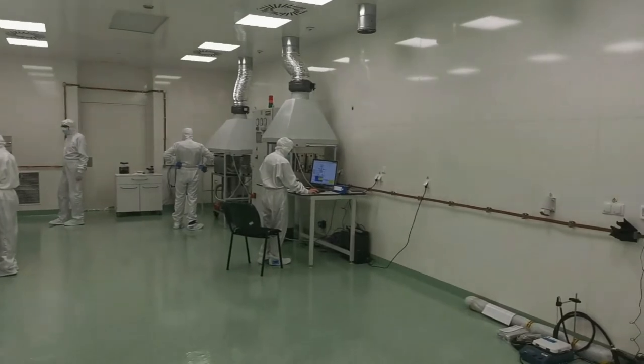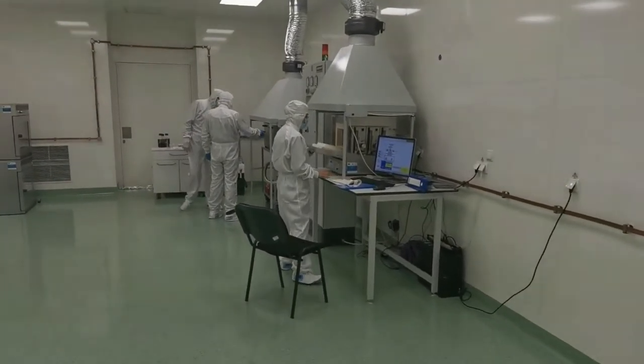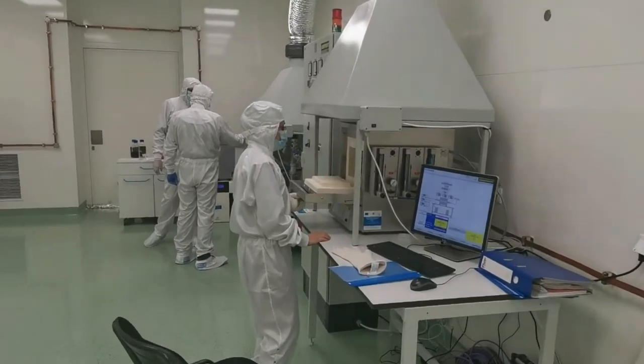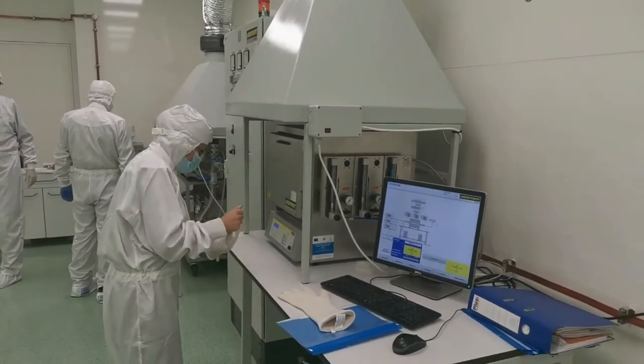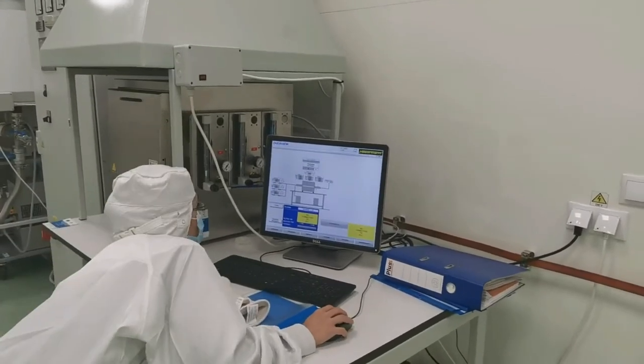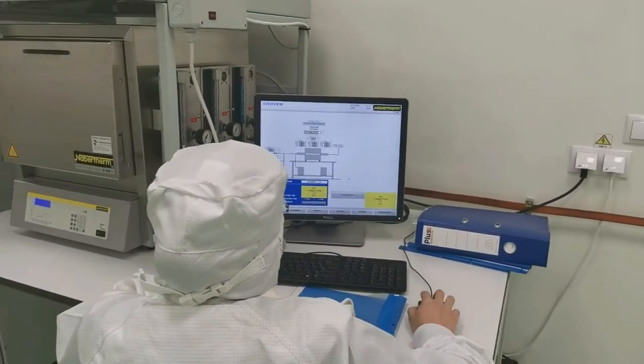The chemistry room is mainly dedicated to surface conditioning and thermal treatments of the samples. For this, several ovens are used, like the calcination oven used to perform thermal treatments in air or under controlled atmosphere suitable for thermal treatments up to 1300 degrees. The acceptable sample size is 200 mm.